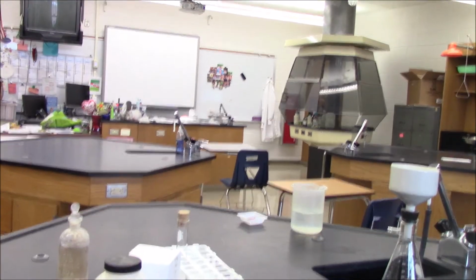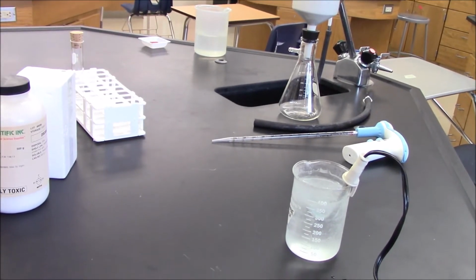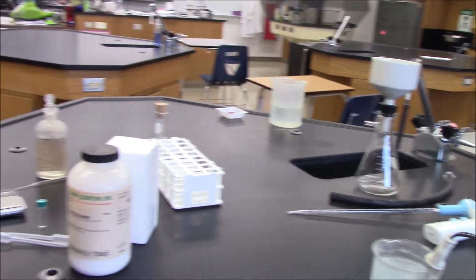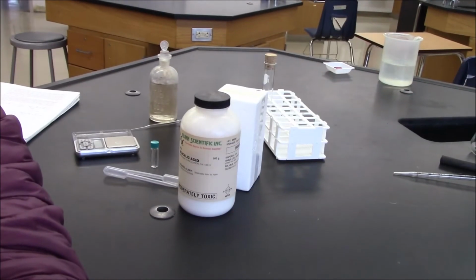Hey guys, I'm back to do our second ester lab, and in this experiment, acetylsalicylic acid, or aspirin, is going to be synthesized through the acid-catalyzed esterification of acetic anhydride and salicylic acid. To start, what you can see is my setup. I have a hot water bath that I'm just beginning. In the back there you can see I have my Buchner funnel apparatus, and then here are my chemicals and my balance.